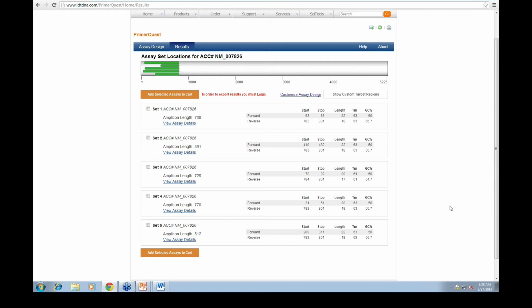So most of the time here at IDT, when we are designing genotyping assays, we actually use LNA PrimeTime probes. For those of you who don't know about LNA, they're locked nucleic acids, and they will only bind to their specified target. So an LNA A base will only bind to a T base, LNA G only to a C base.